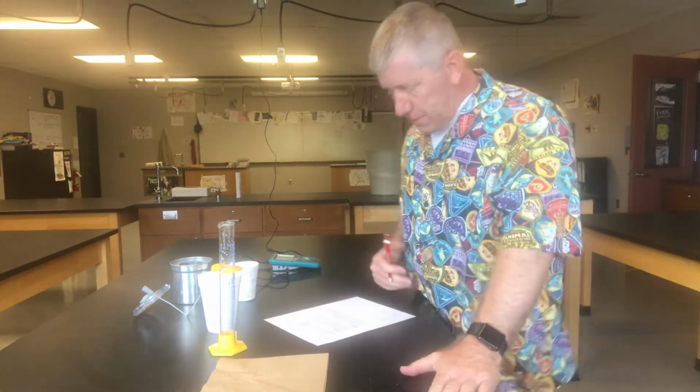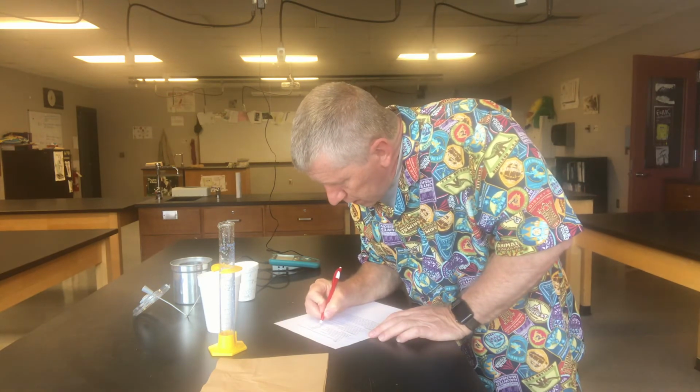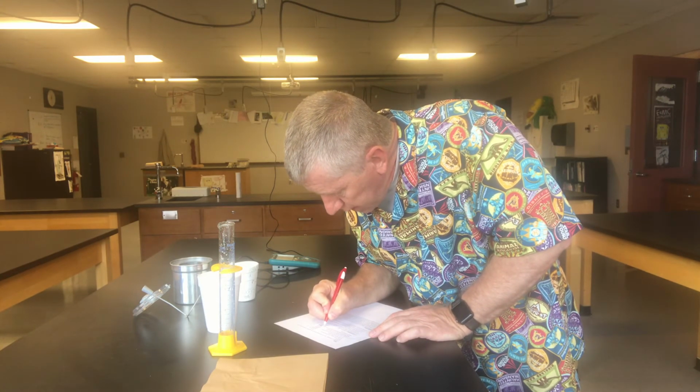Well, actually, you know what? We can go ahead and put the mass of the ice added, that's the last one, as 24.1. And actually, that 123.4 I just a minute ago said we're not going to put down anywhere. Well, we could actually put it in the data table. We don't have to, but we can put it above where it says mass of water after melts. That means the milliliters of the mass of the water after it's all melted. And we did get that with 123.4. So I'm going to go ahead and put 123.4 in that spot, the second to last spot.